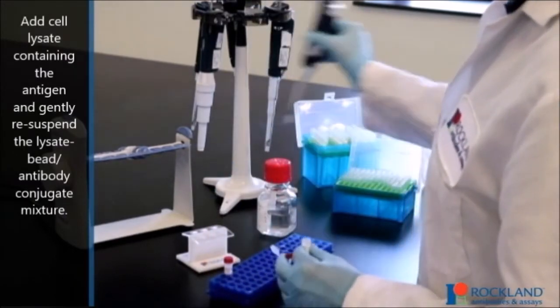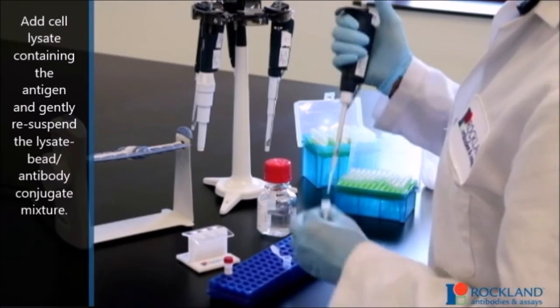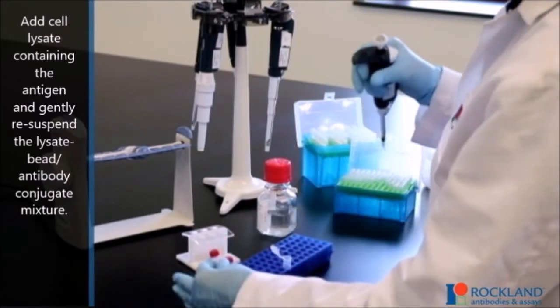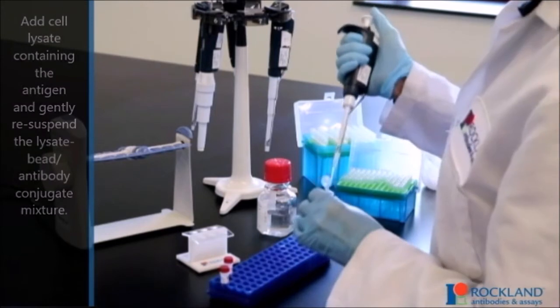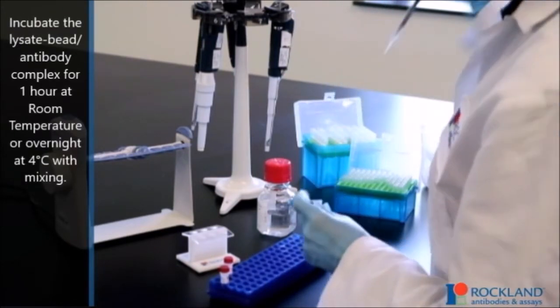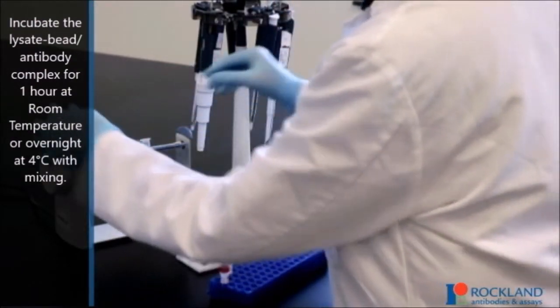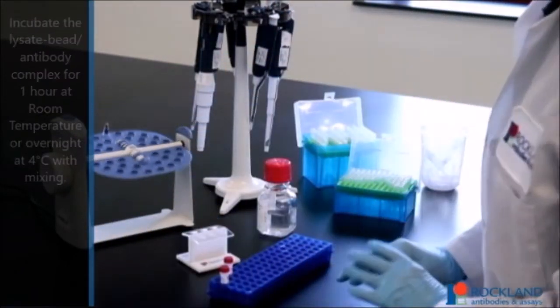Add cell lysate containing the antigen and gently re-suspend the lysate bead antibody conjugate mixture. Incubate the lysate bead antibody complex for one hour at room temperature or overnight at four degrees Celsius with mixing.